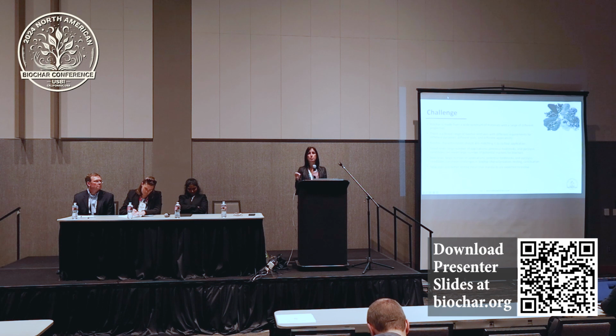Then you have the fact that biochars, just by holding them, might change their properties over time. So all this makes biochar a very, very challenging material to have standards for testing. So ideally, we want to do biochar characterization and match it to the final utilization.